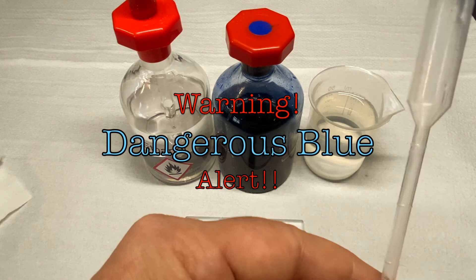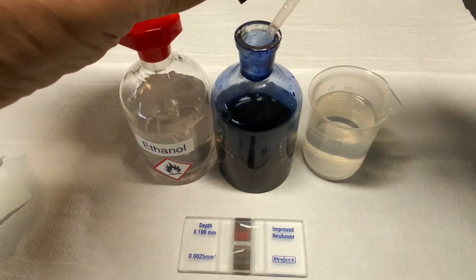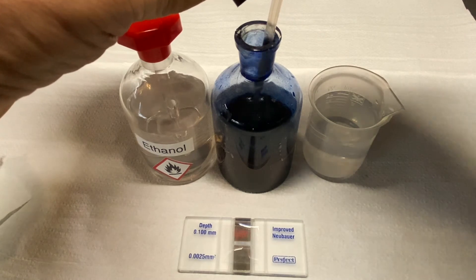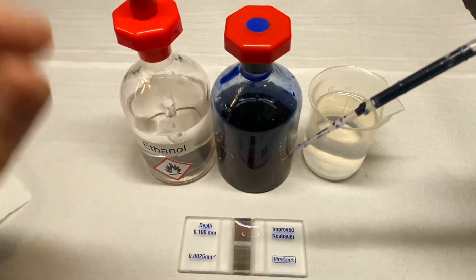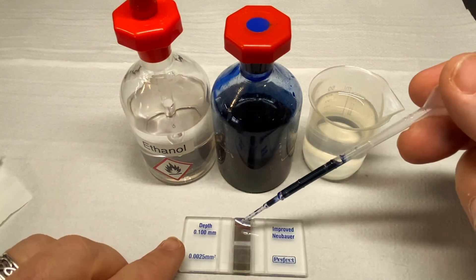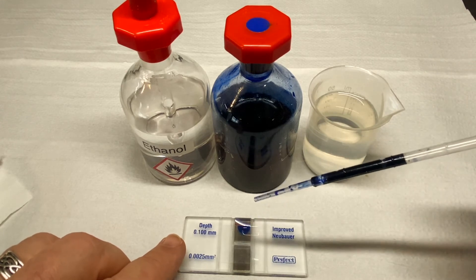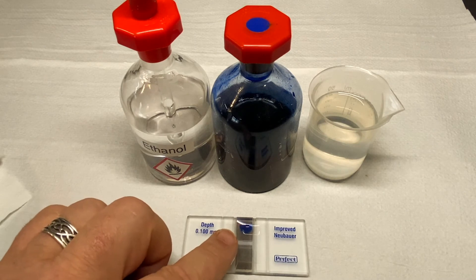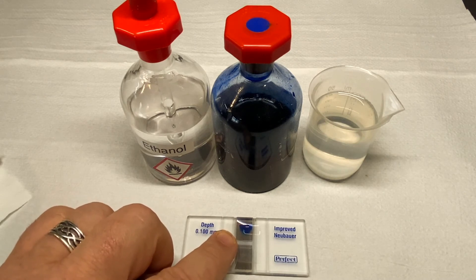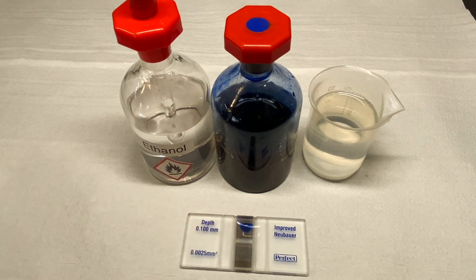During this demonstration of capillary action, I will be using Dangerous Blue. Rest assured, no technicians were harmed during the making of this video. From the appropriate sample, take a drop and place it at the edge of the coverslip. The water already in position under the coverslip should draw the sample evenly under the coverslip and across the gridded section. Before examining under the microscope, allow the sample to settle for around one minute to avoid any motion in the sample itself.